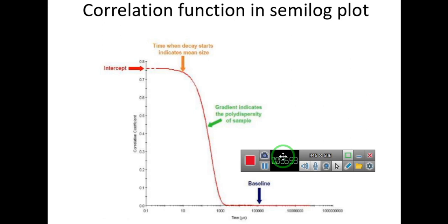And based on how fast the time intensity changes, you will get the information about the size. So they are related to each other.